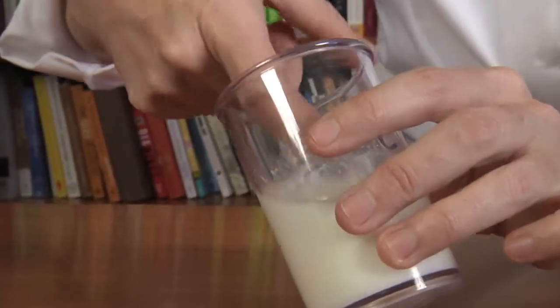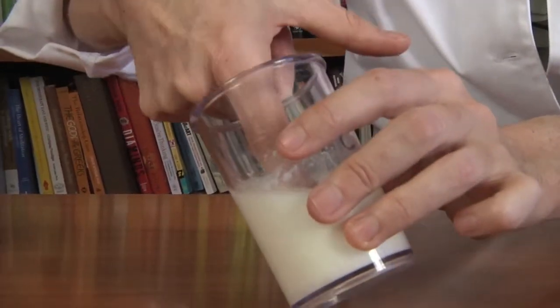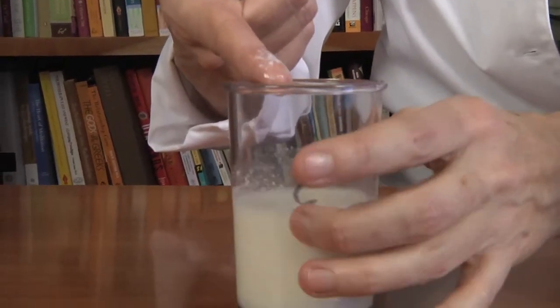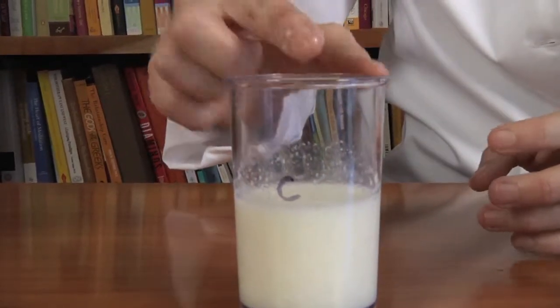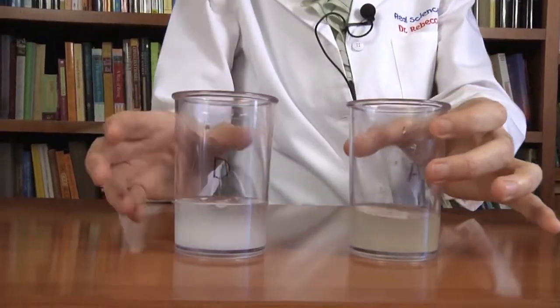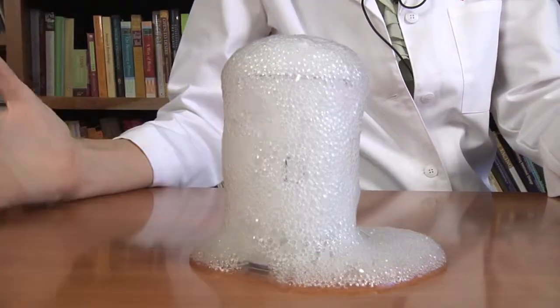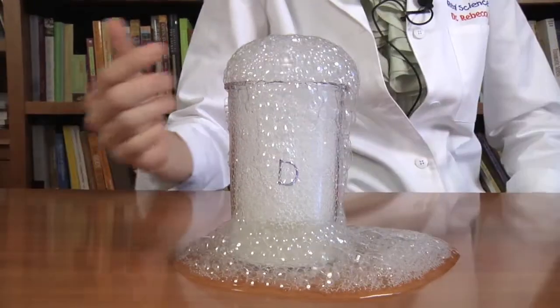And if I put my finger in there, you can see that it's changing. The white stuff is changing. When I added A to C, I'm getting a chemical reaction. Now let's see what happens when we add A to D. What do you think is going to happen? I have a feeling there's going to be a nice big chemical reaction. Let's find out. Yes! Big chemical reaction with lots and lots of bubbles.